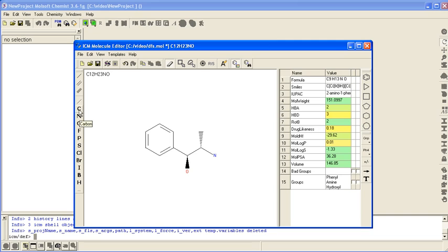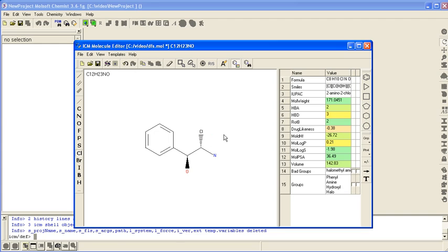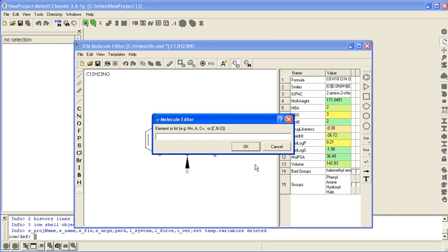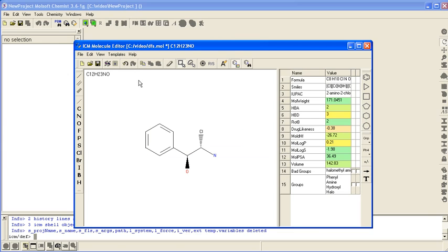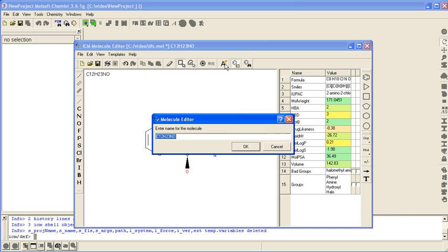There are other atoms. You can change the atoms. You can also change the name by clicking on this button here. You can enter a name for your compound and it will be displayed here.